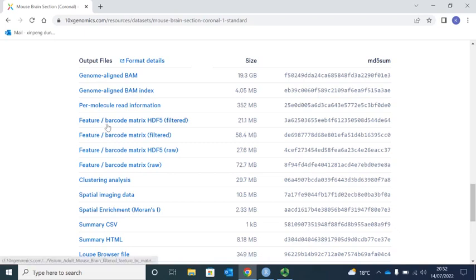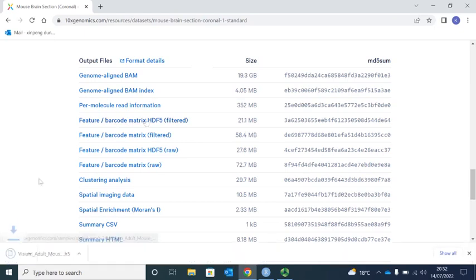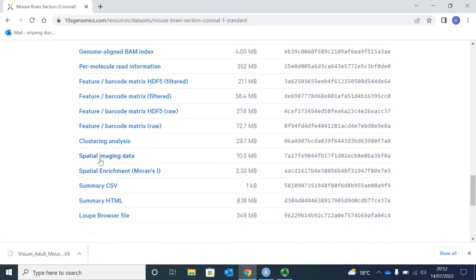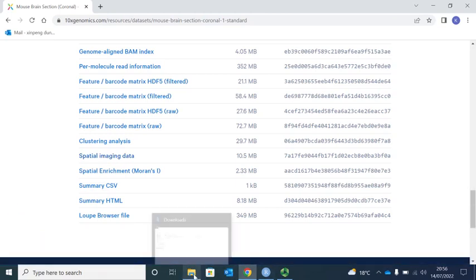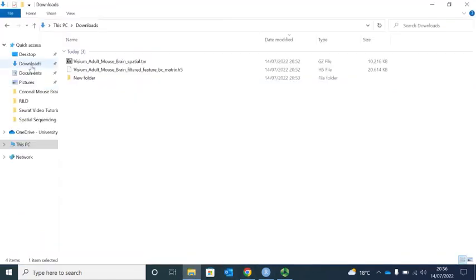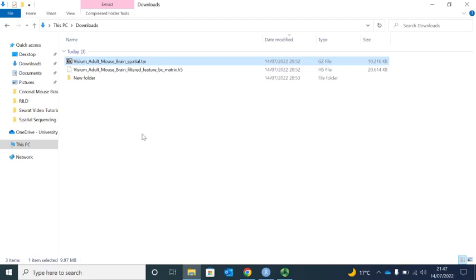We can press the link to download the HDF5 file. We also need the spatial imaging data — we need to download that one as well. Now we can open the download folder. We have two files: one is the features, barcode, and metrics file, and the other one is the images file. The image file is a compressed file.